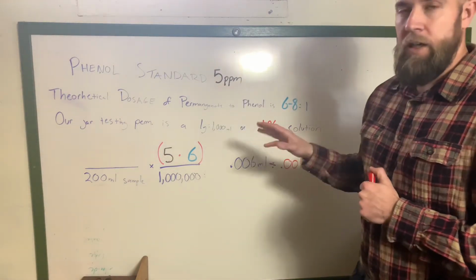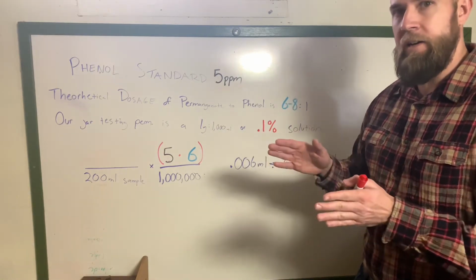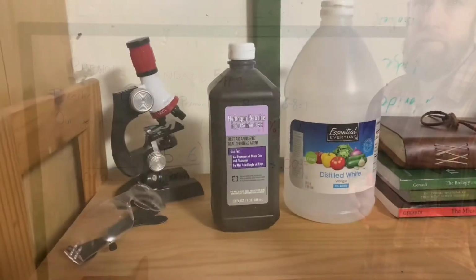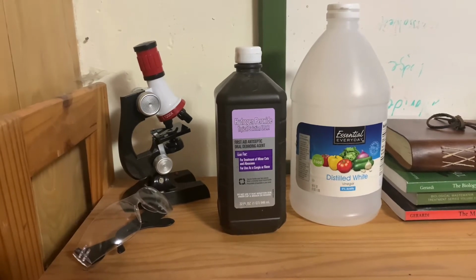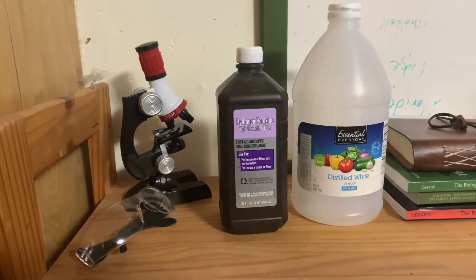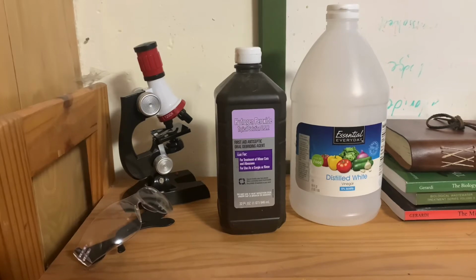And we're going to do a couple other dosages because I want to bracket it. I want to get a low and a high and narrow it down. And we'll show you what that jar testing looks like. For safety purposes, go ahead and make down a hydrogen peroxide vinegar mix 1-to-1 solution. And you can use that for any spills that happen. It'll neutralize the permanganate. Store-bought is fine. You don't need anything high grade or high strength.